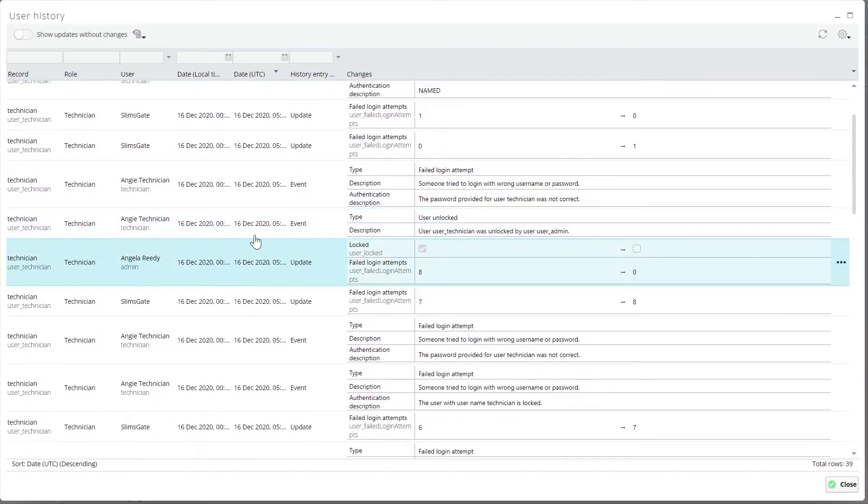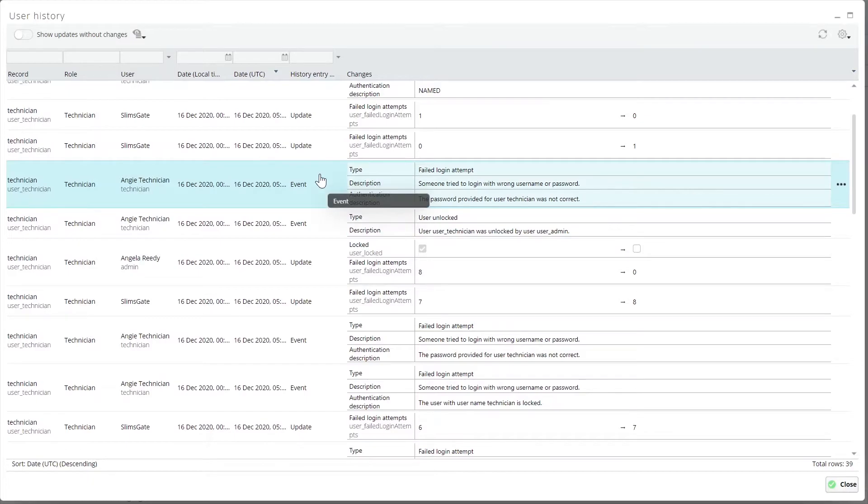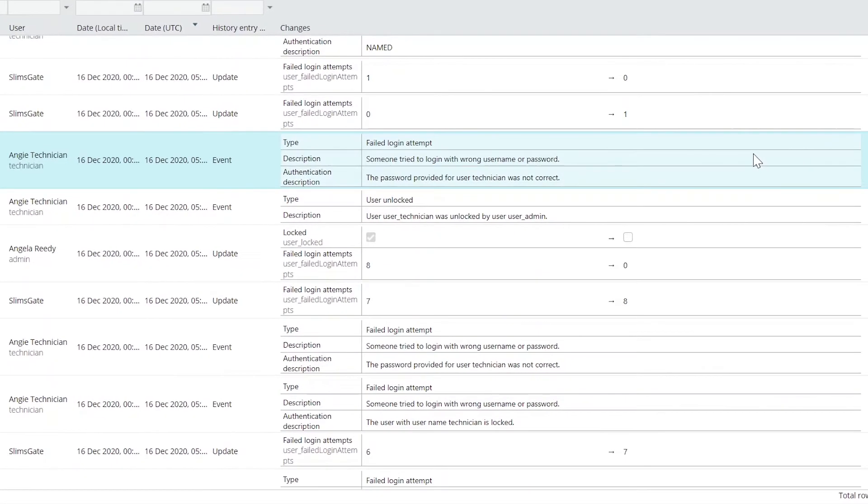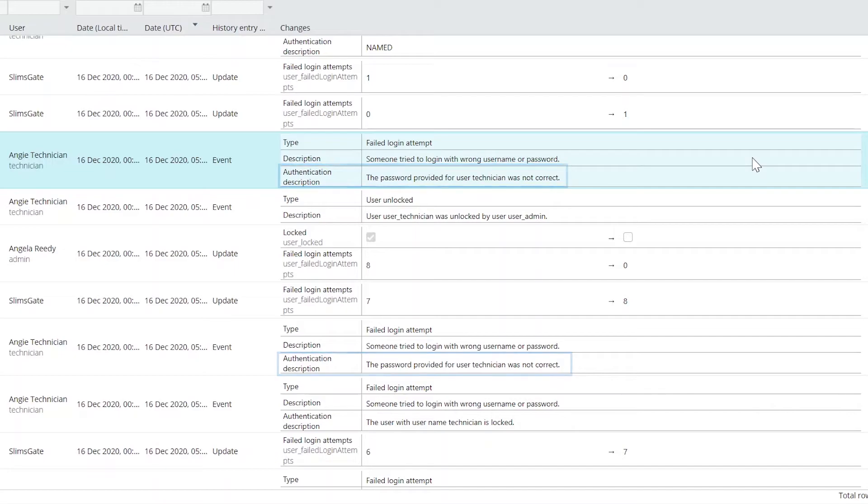There are new rows in history grids to help differentiate between various actions, such as authentication events, comments, and descriptions.